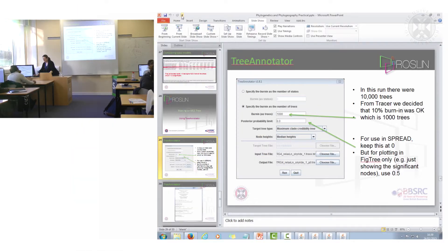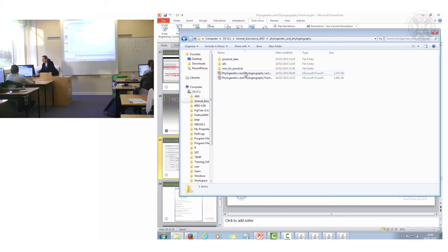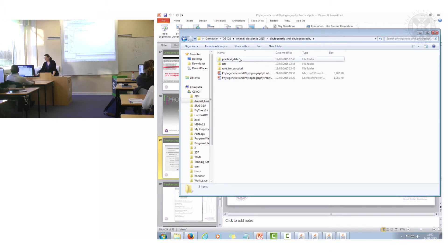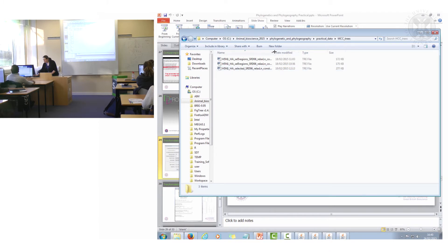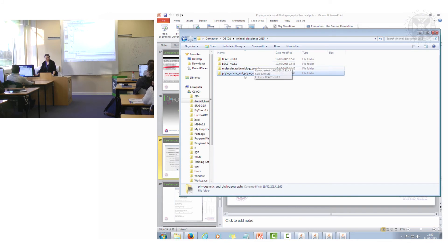You've got one tree to look at, but also have a look at the other trees I've already made. You have a choice: you can either remake them with Tree Annotator, or use the ones I've already made. The pre-made ones have host or region included as a discrete trait — open those in FigTree. I'll show you how to make them yourself in Tree Annotator if you want.